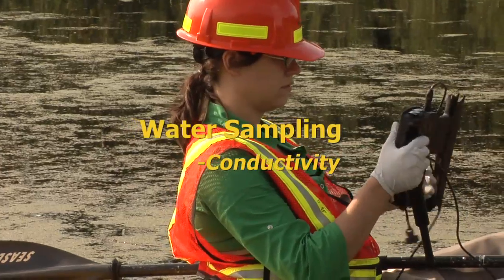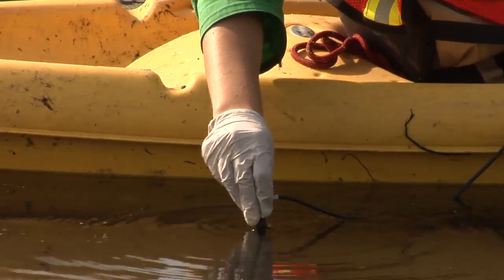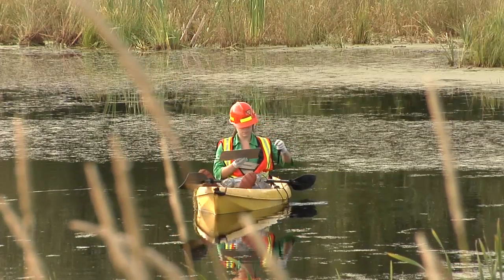To measure conductivity, lower the tip of the conductivity meter so that the probe is submerged. Wait for the conductivity meter to stabilize and record the conductivity reading.